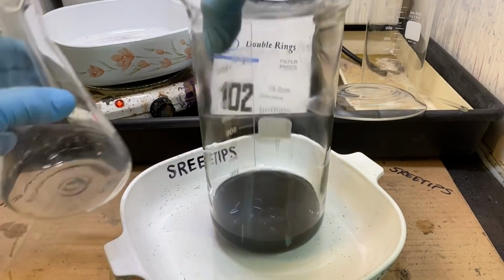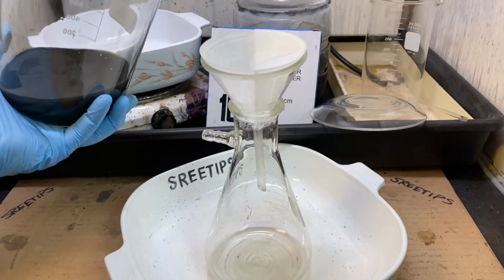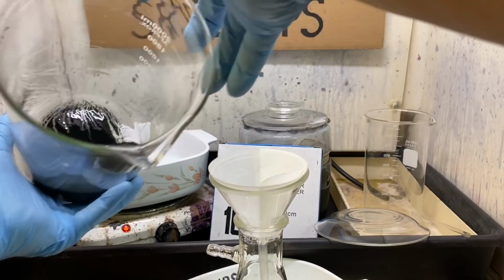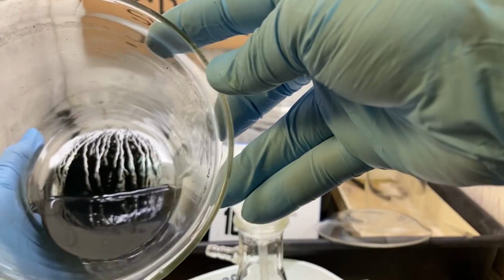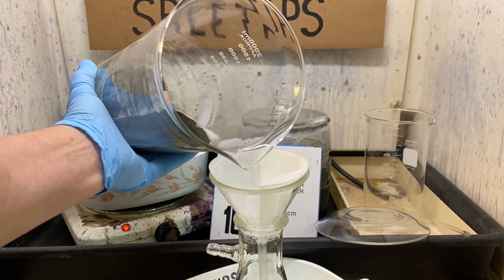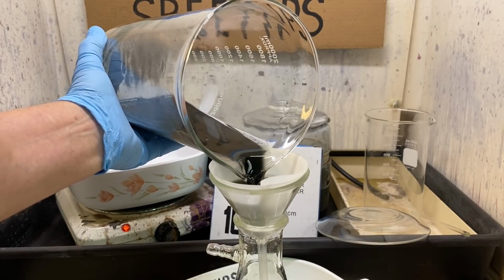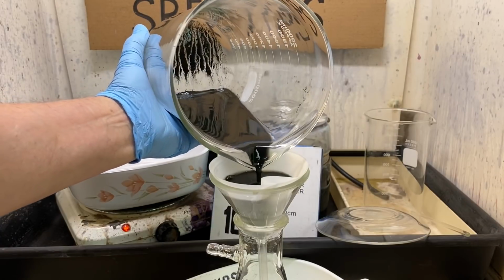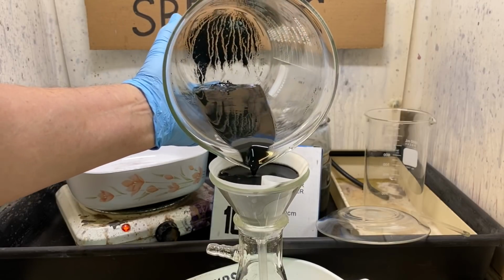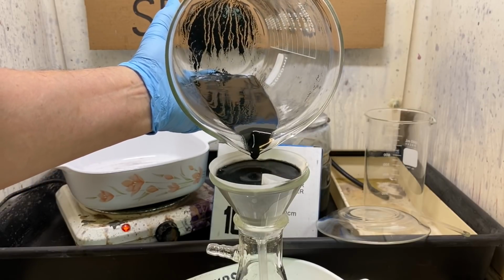I've got a filter set up here. Now what we'll do is, hopefully those 2 rinses were enough to get all of the acid off of our solution. I'm going to try to filter this out now and collect the solids in this filter. It's our black powder. It's looking pretty good. I think this is going to work.